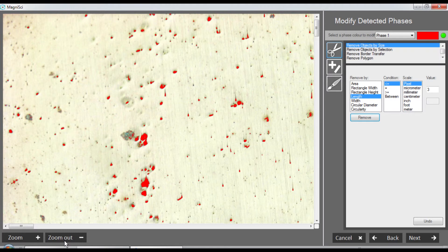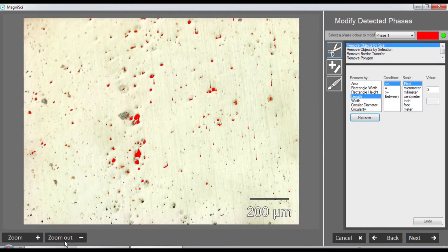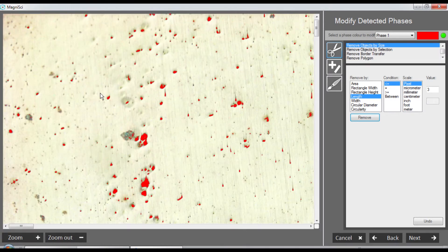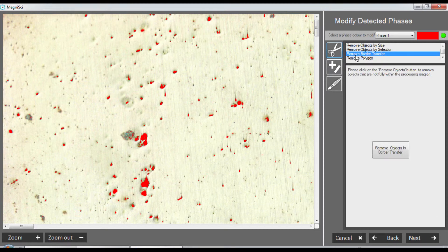In other cases particles are touching the border, so I am also removing those particles using 'remove objects that touch the border.' These are removed as well, and now I am happy with this and we will go forward to see what happens to our report.